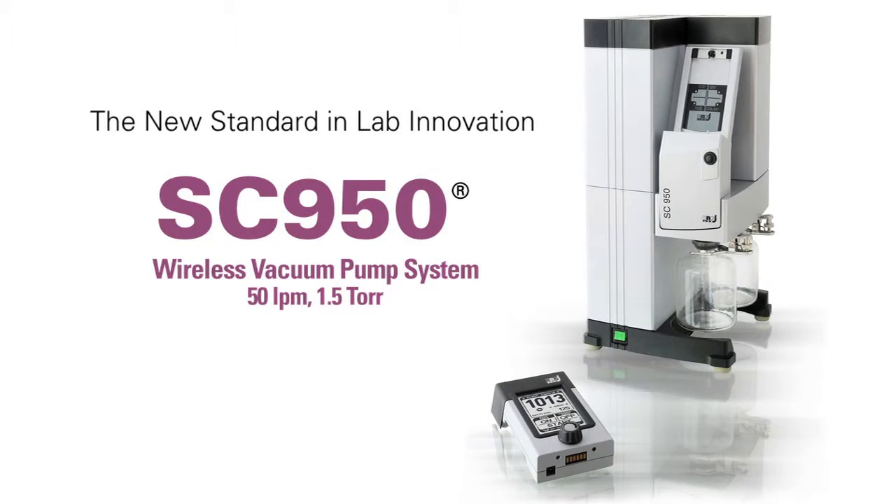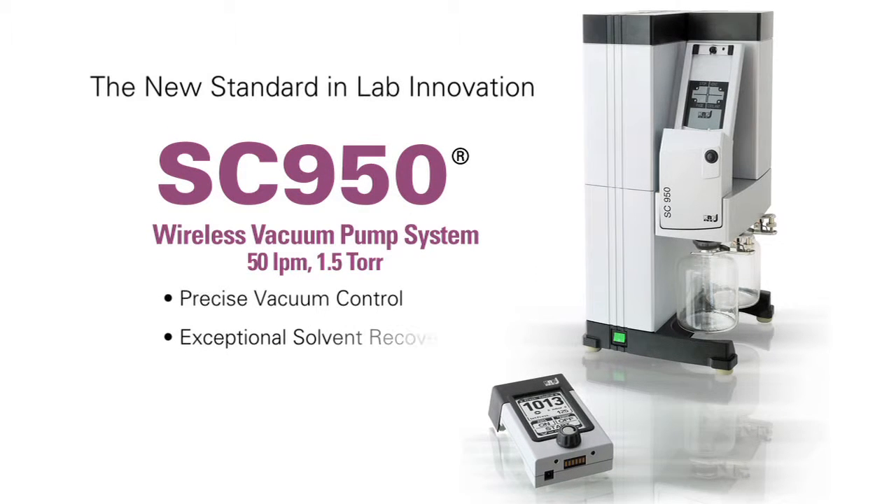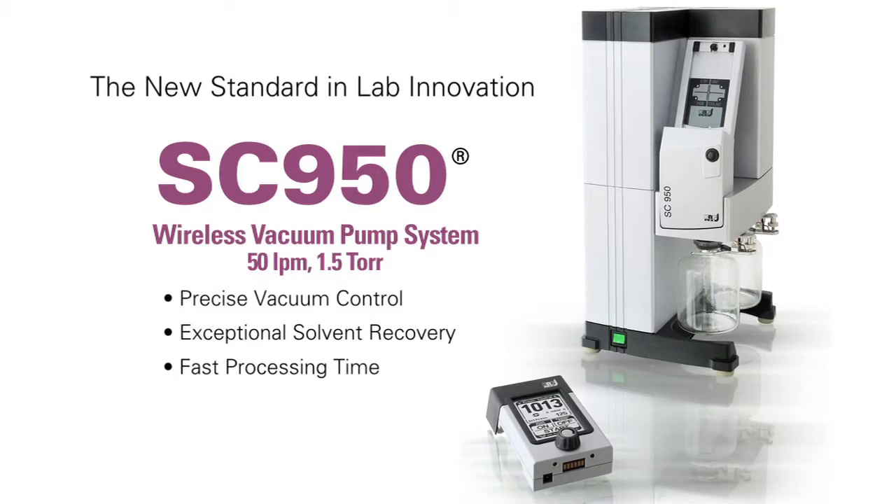Hello, my name is Dan McDougall. I'm the senior manager for KNF Lab, and I'd like to introduce you today to an exciting new product, the SC950 vacuum pump system. The SC950 offers precise vacuum control, exceptional solvent recovery, and fast processing time.